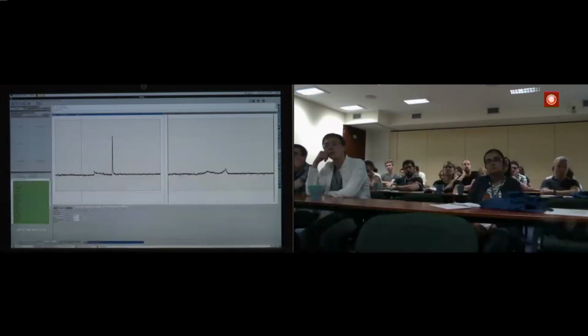So let me magnify that area. That particular signal belongs to the carbons residing on the methyl groups, not on the phenyl groups. So you see that by introducing heteronuclear dipolar decoupling, we reduced that coupling and we made this signal more pronounced over here because it's much narrower now.